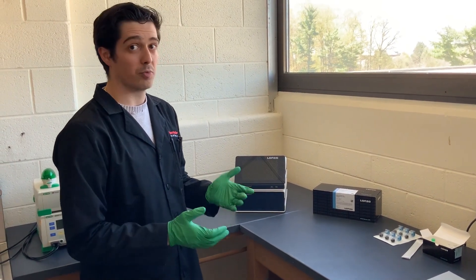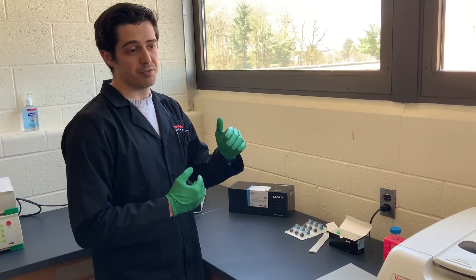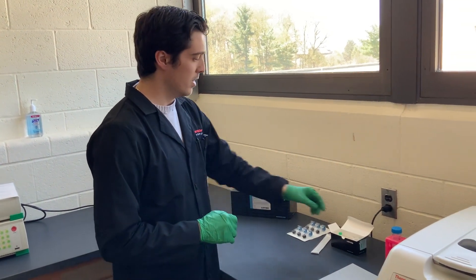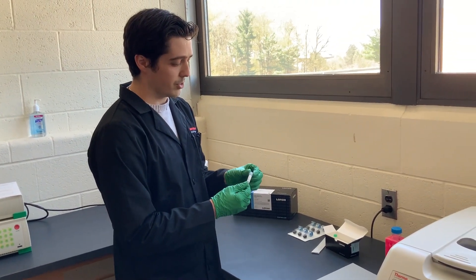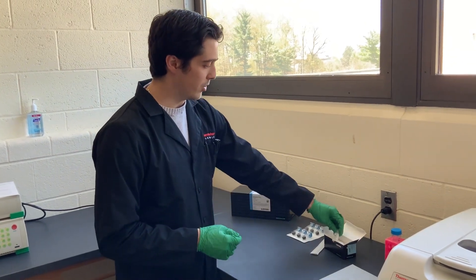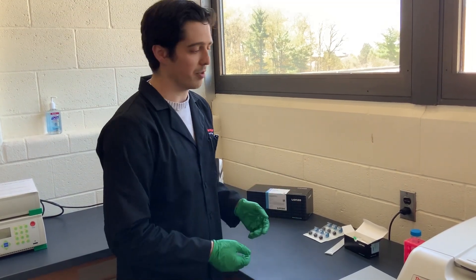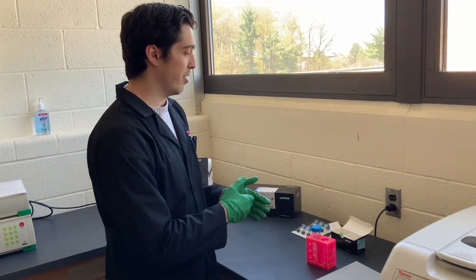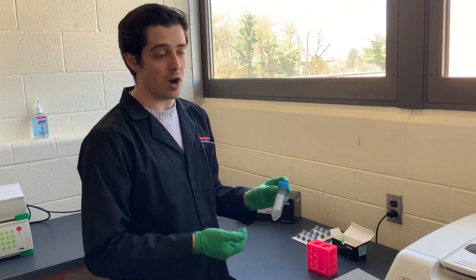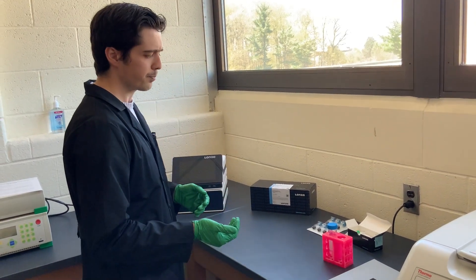Now for the actual protocol: depending on which buffer kit and which plasmid you're going to be transfecting, that needs to be optimized, with specific details in the protocols for your specific cell line. The first step is to take your cell line buffer and mix it with your plasmid of interest in an Eppendorf tube at whatever proportions the protocol specifies. Set that aside and have it ready. After combining your buffer and plasmid, spin down your cells — I like to use 50 mL conicals — at a slow speed around 90G.